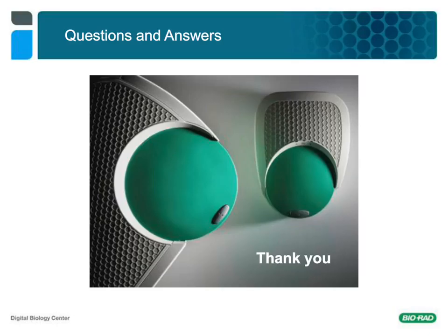Excellent. Thank you there, Dr. Shelton. If we move on now, we've still got a few questions coming in. Our next one is, is DNA extraction a key step in order to perform ddPCR on circulating tumor DNA from plasma samples?